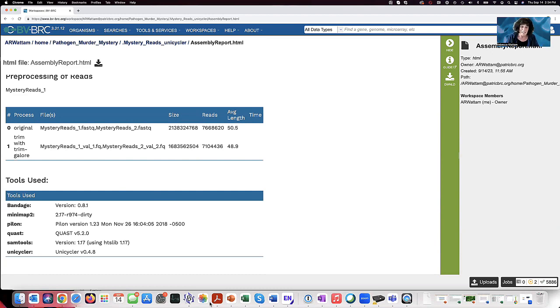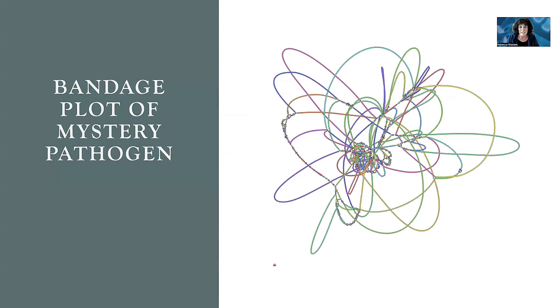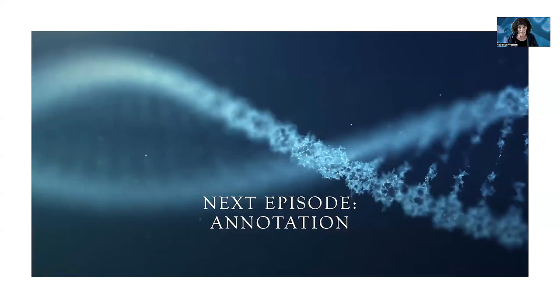So that's it. We saw the QUAST report, we got to see the Bandage plot, and then next time we really get into annotation.